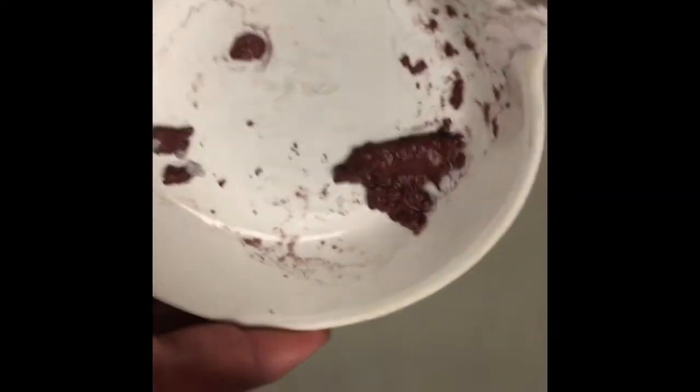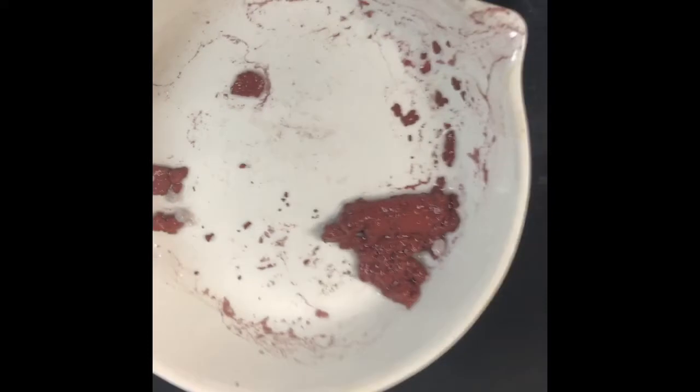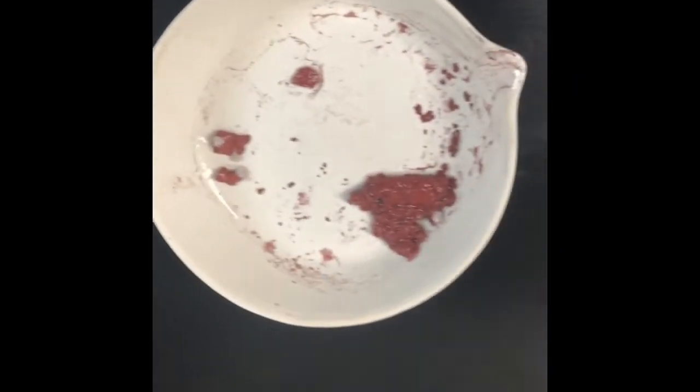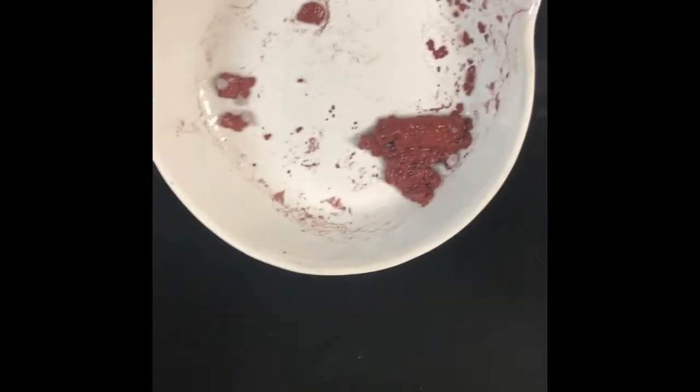Okay, so let me go show you what the oven looks like. We're going to leave it in the oven for about 15-20 minutes, and then we're going to reweigh it. Now, as we've gone through this process, it's been really hard not to lose a lot of copper because we've gone through 5 or 6 different reactions and we've poured off. So we're looking to get a good % yield on this. So here's our oven. Looks like this. And we're going to leave it in there for about 15-20 minutes.